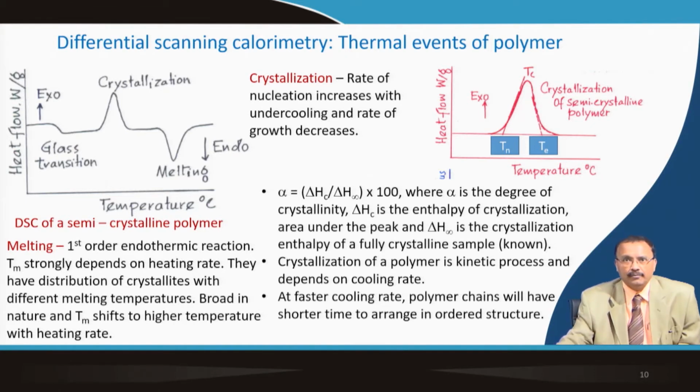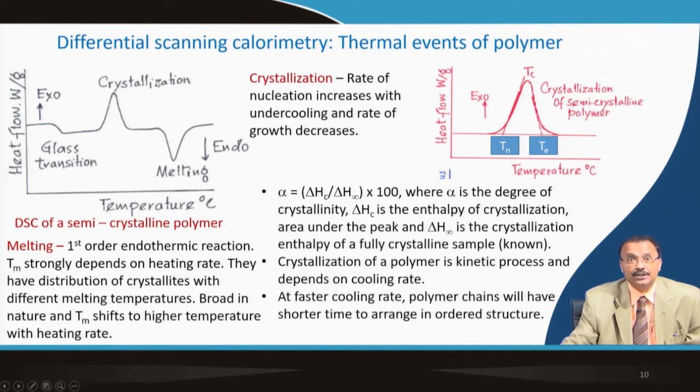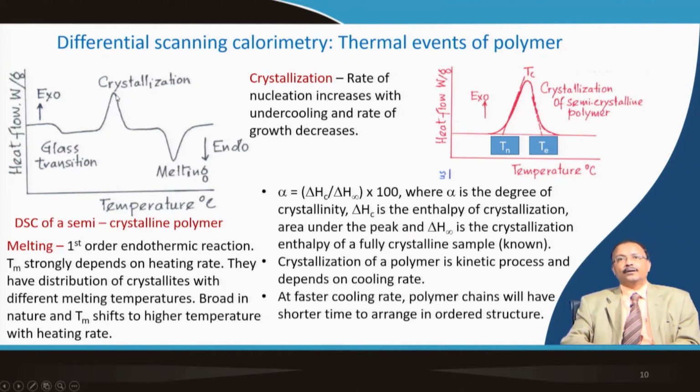Crystallization, as you know, basically depends on nucleation, and from the melting, if you cool it down, it depends on the undercooling.